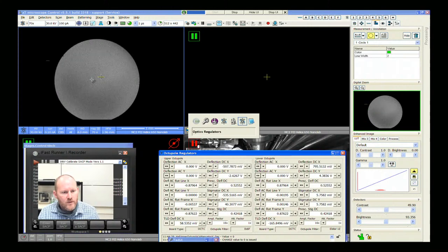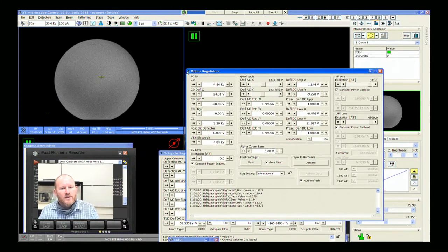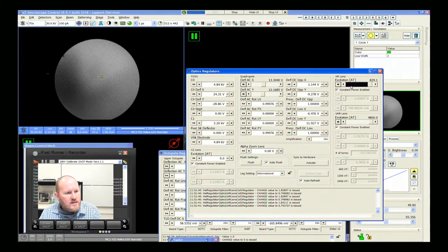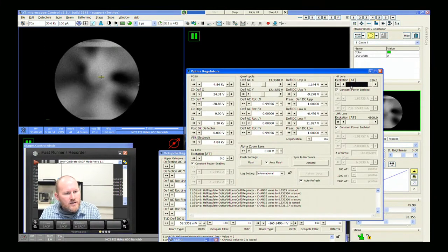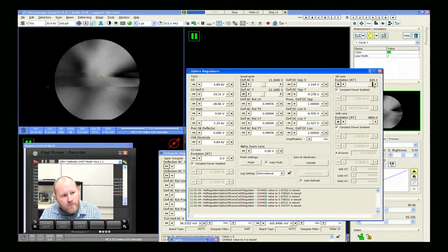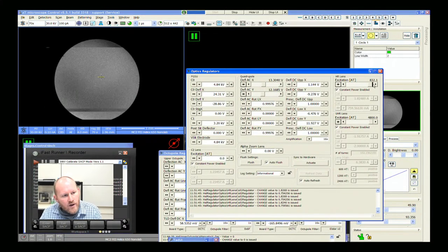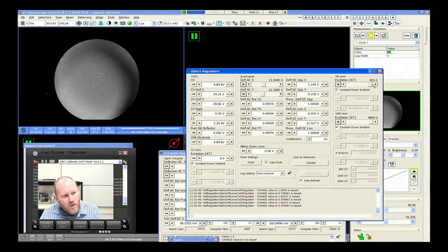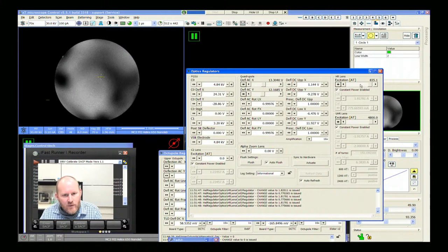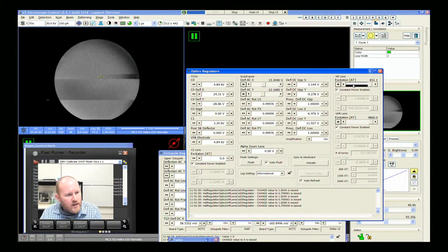Looking at the optics regulator: 831 amp-turns seems to be a decent point for what I would call the optimal rocking angle.